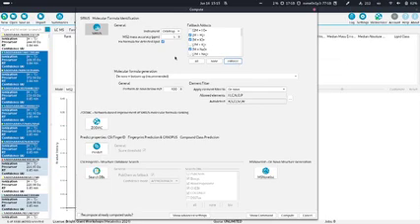Small question here. On the adducts, I quickly read through the list, and I see that there are only single charge states. For instance, the natural product compound has a +2 or +3 charge, which is not seldom in the nature of natural products. How does the software handle this? Currently we just support single charged, because multiple charged probably fragment very differently.